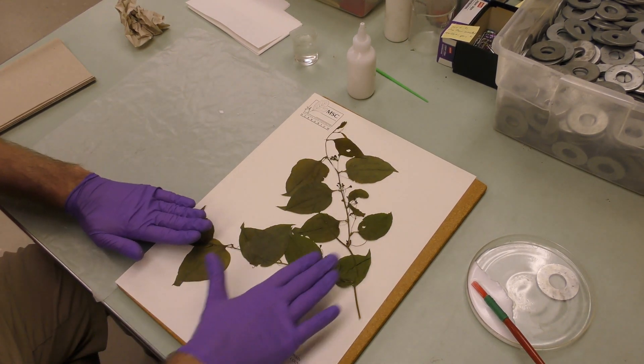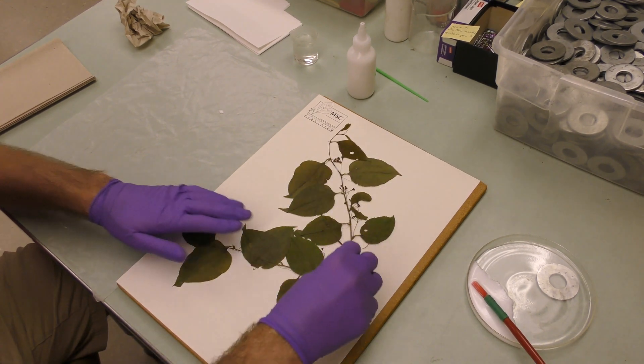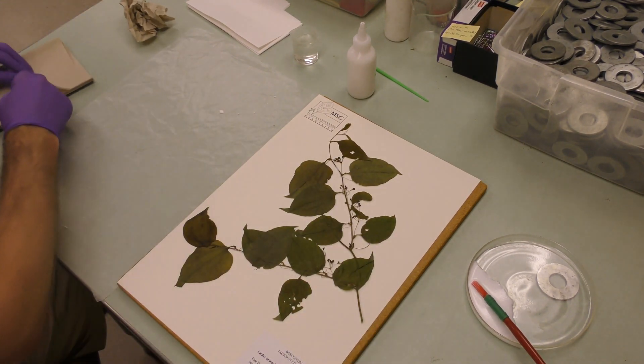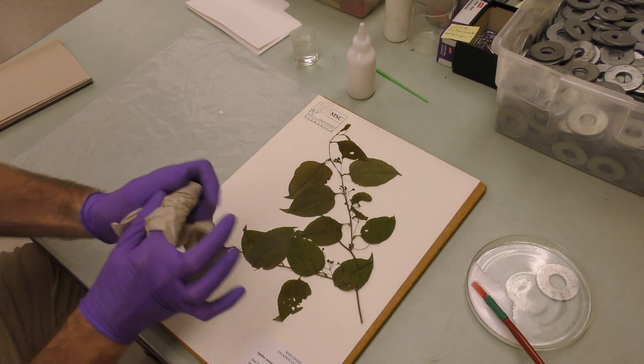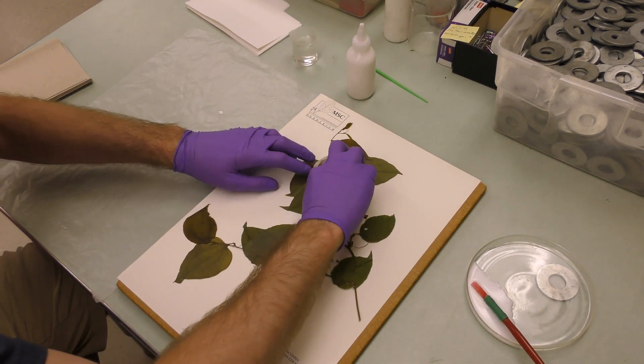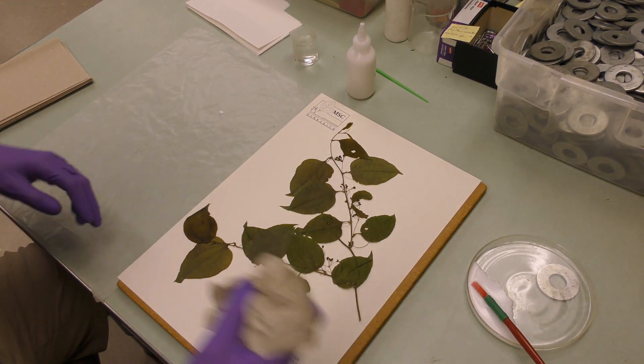You can kind of see with these upper parts especially, there's a little bit of glue that smushed out. What you can do is just get a paper towel or a napkin or something and kind of wipe that up. It looks really good though.